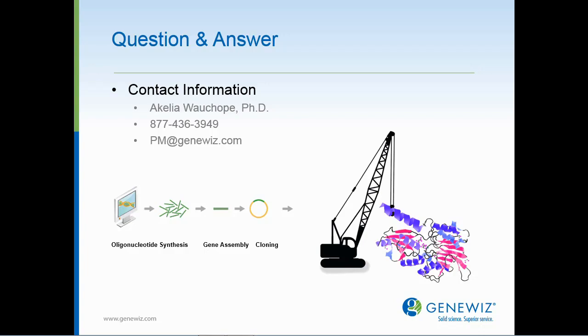And this is actually going to be our last question of the day. The question is, what methods can be used to synthesize unstable or toxic genes that generate toxic proteins?